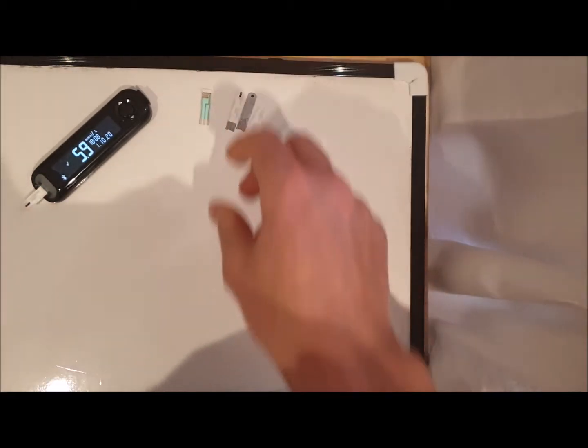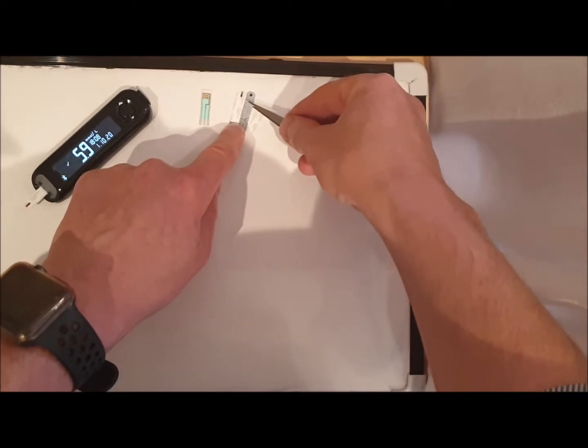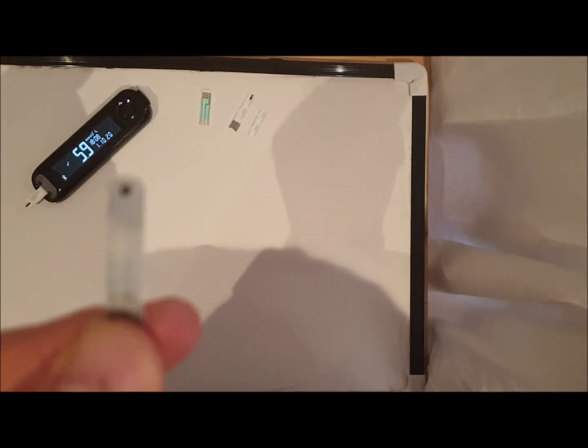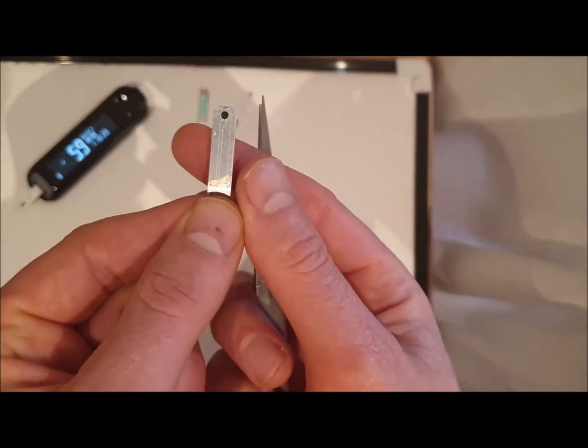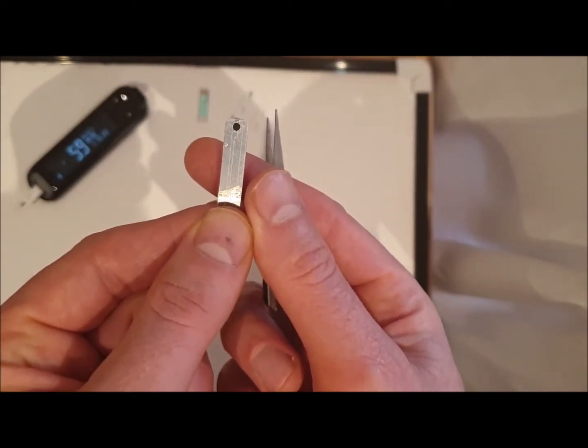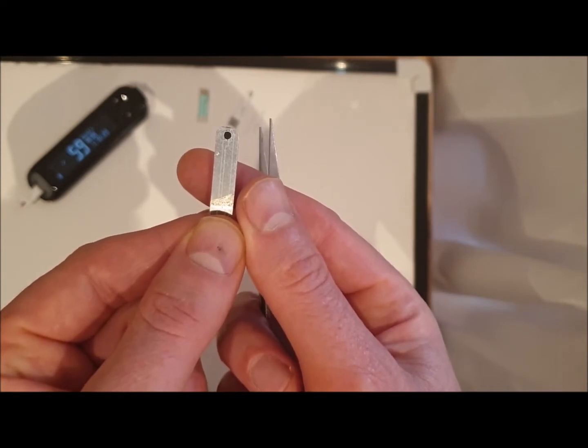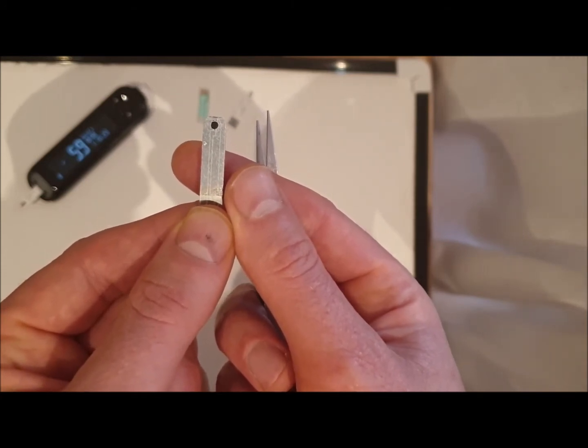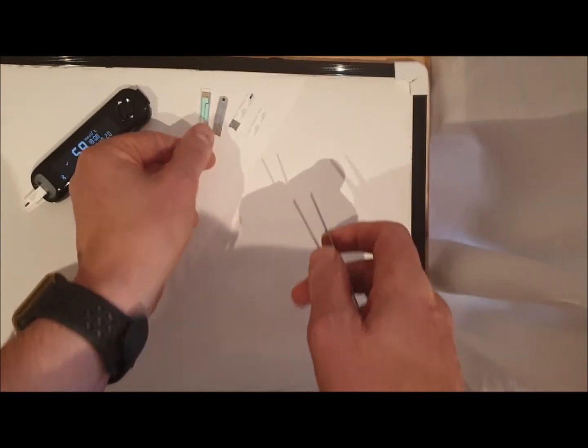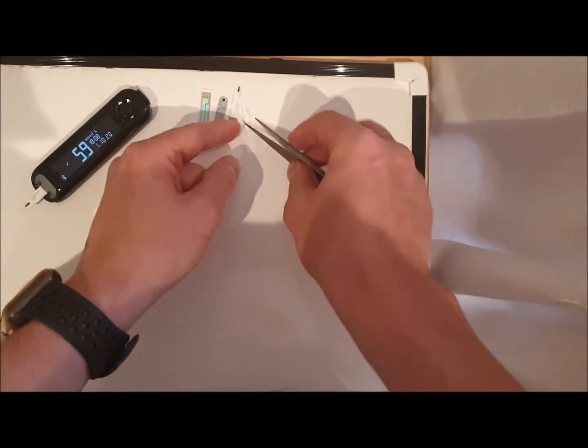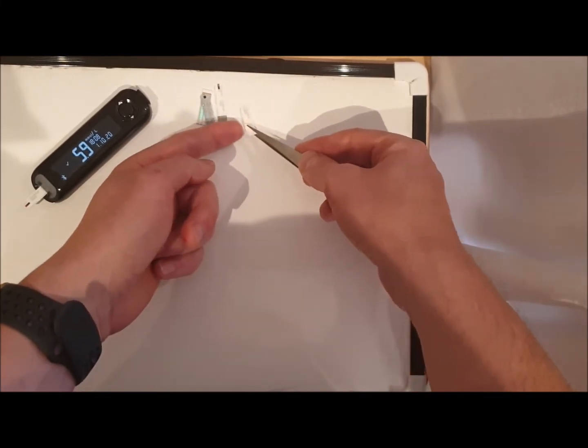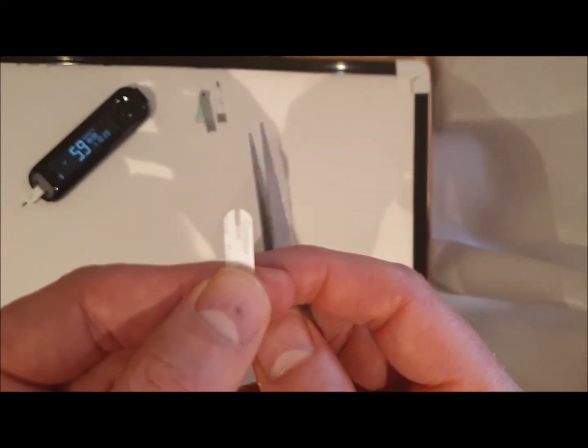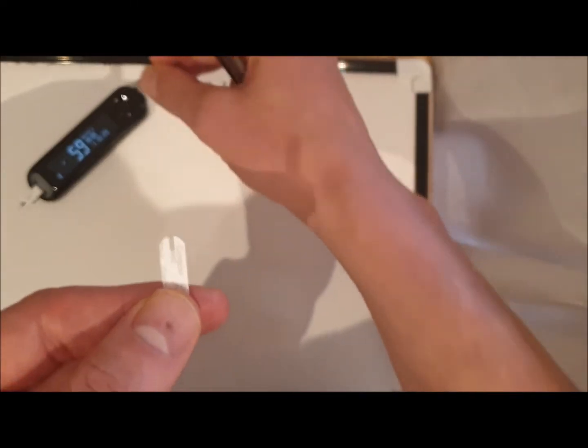Now if we peel back this glucose sensor, what we're going to find underneath it is really a series of conductive tracks. These conductive tracks form an electrochemical cell, and on there there's a biological recognition molecule, which is a glucose enzyme. In order to form that microfluidic chamber so that my blood was sucked into a chamber, they have some laminate materials which, when they stick on top of the glucose sensor, form the chamber.